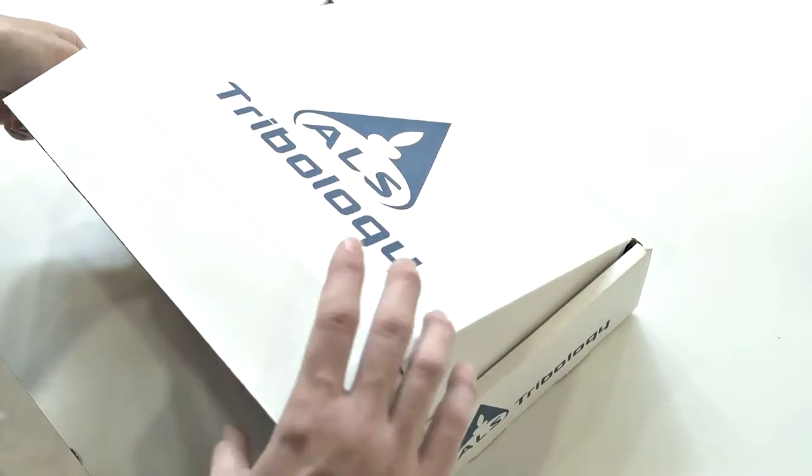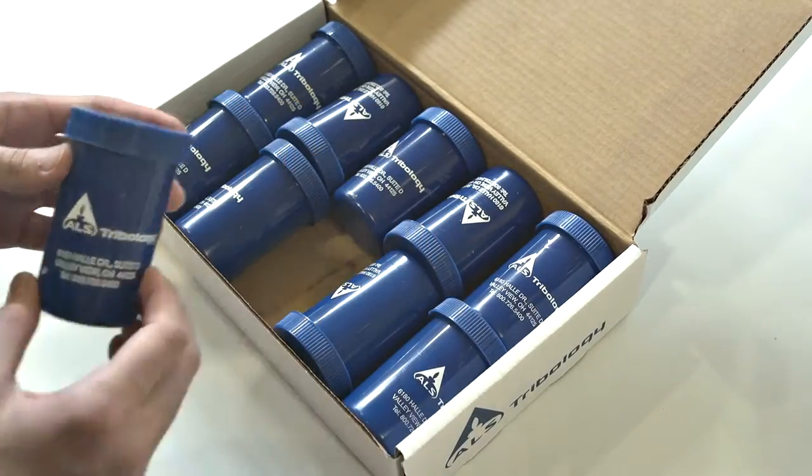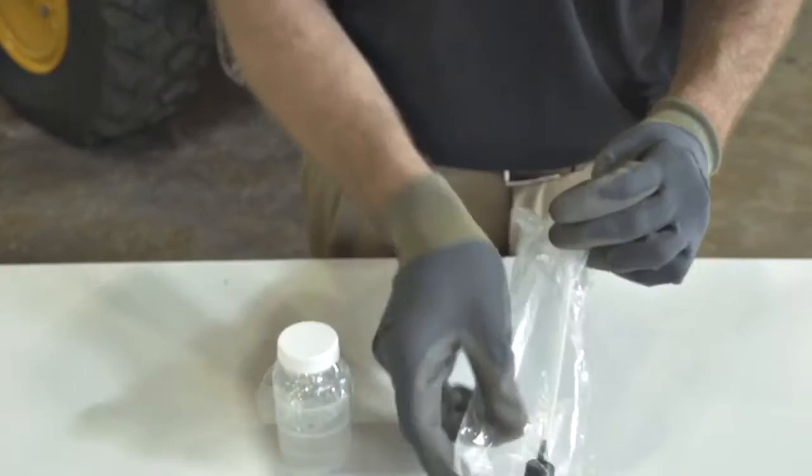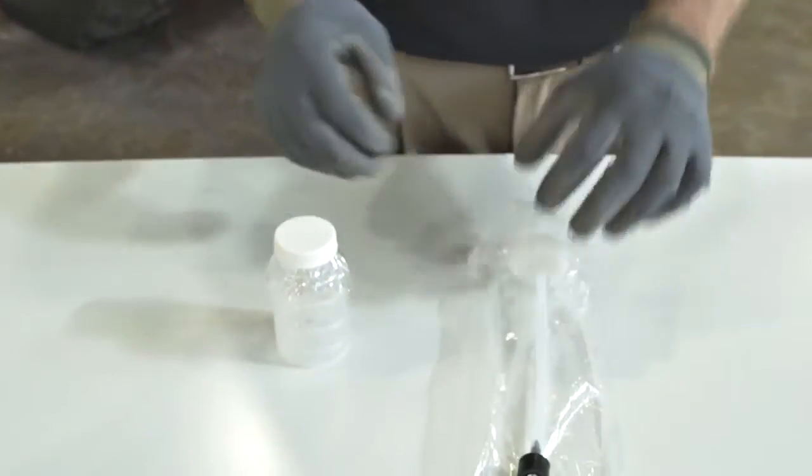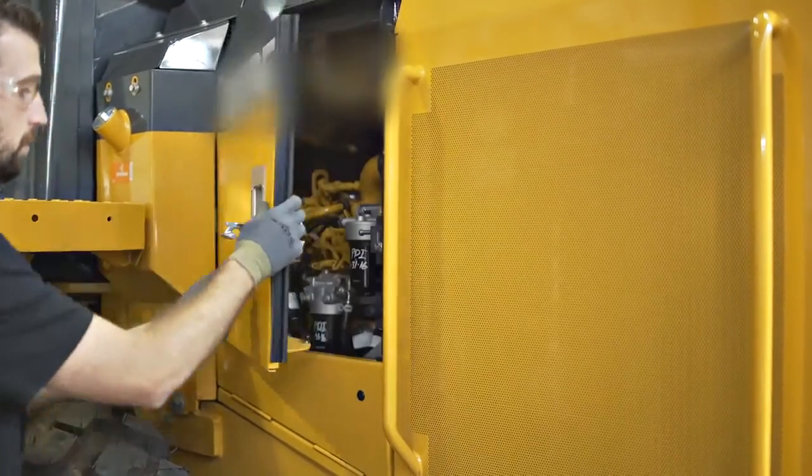Always use clean sample containers and equipment. Store sample bottles and sampling supplies so they stay clean and dry. Ideally, oil samples should be taken in a manner that is easily repeatable and effectively represents the actual condition of the oil in the equipment.